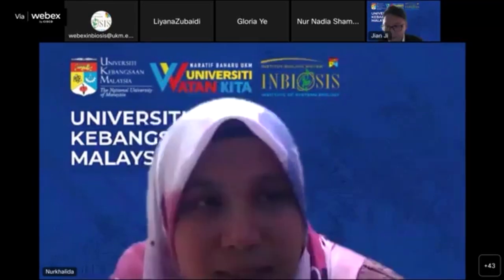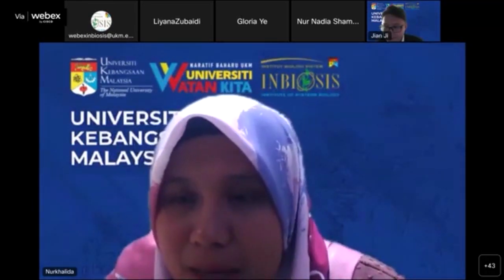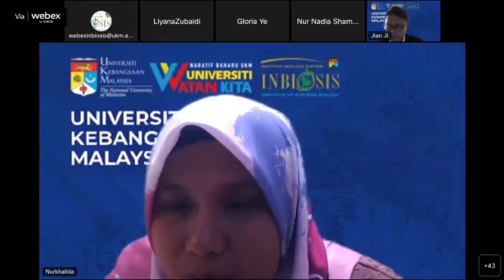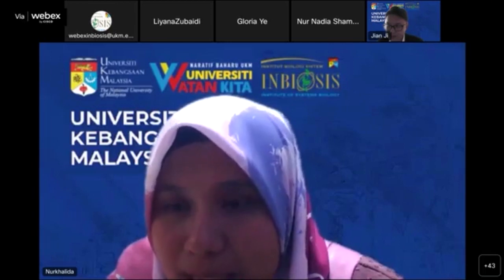Okay. The next question is from Sarah Mahmood. Which is better in determining the effective compounds in plant extract, GCMS or LCMS?